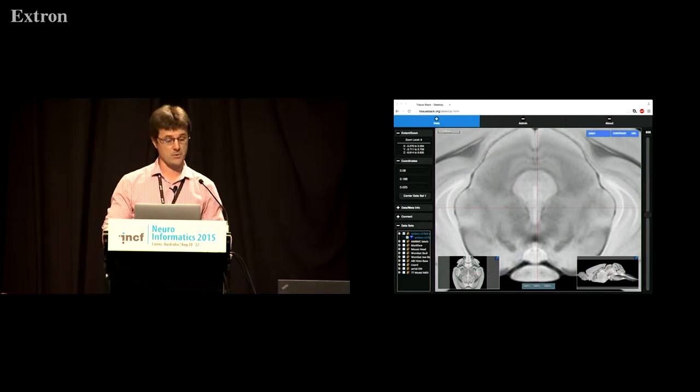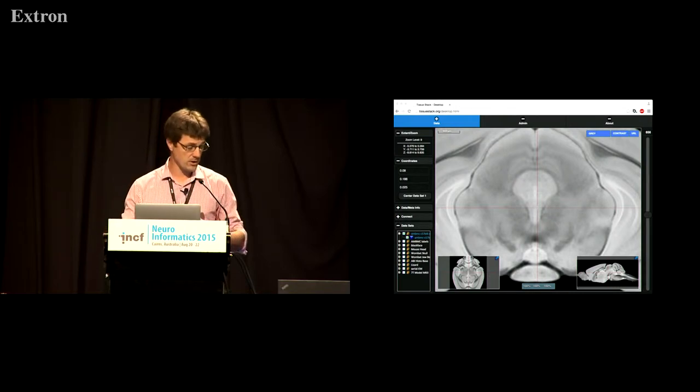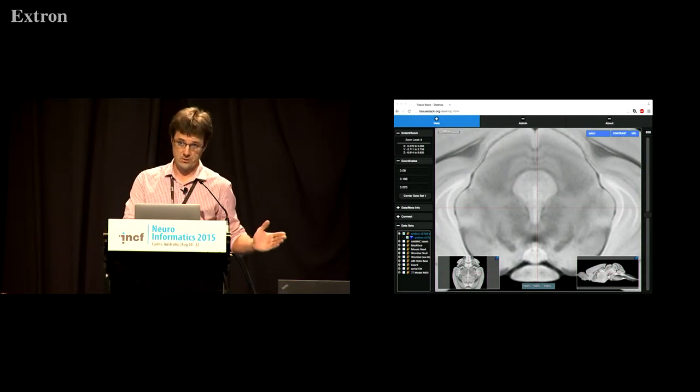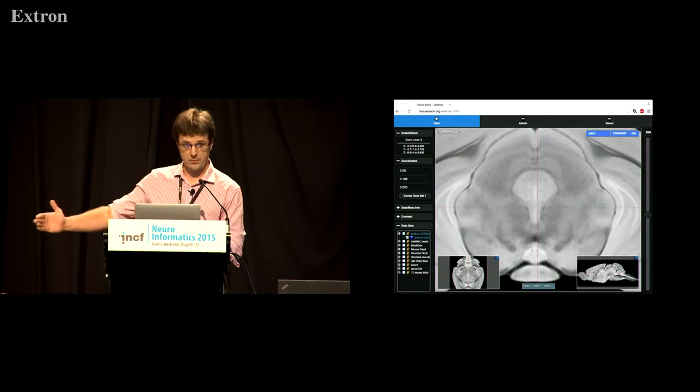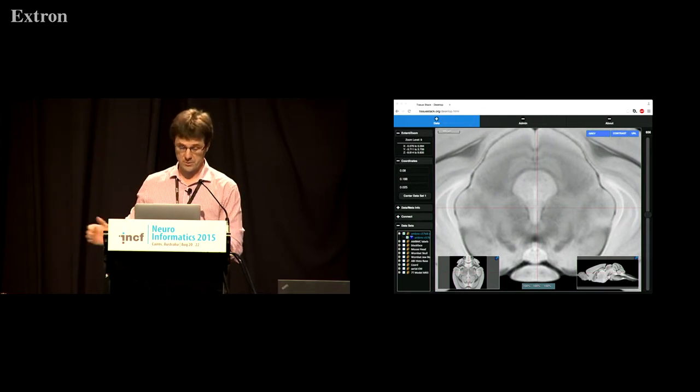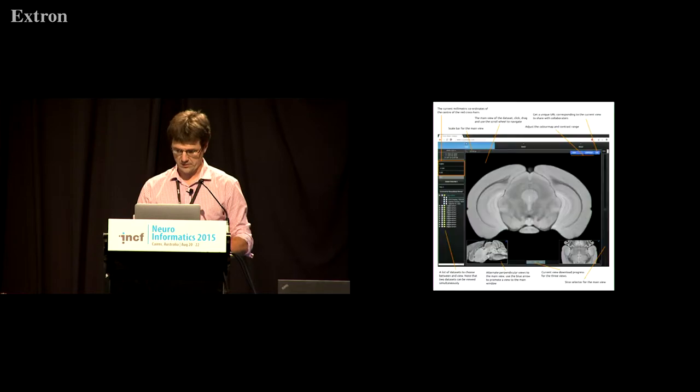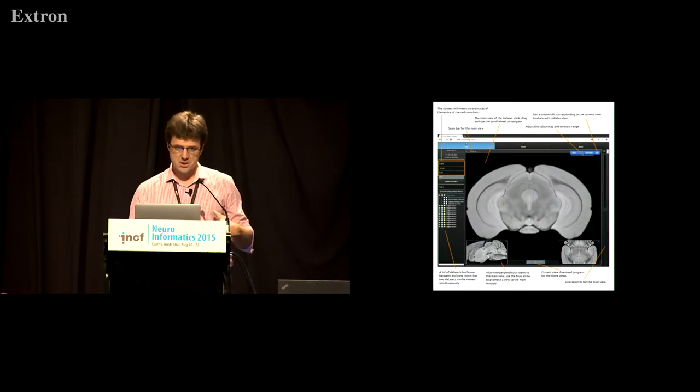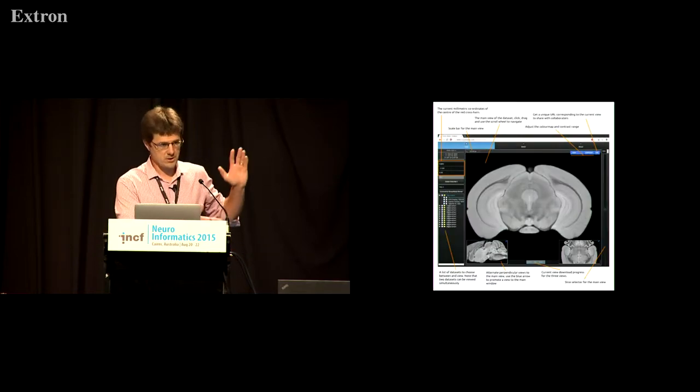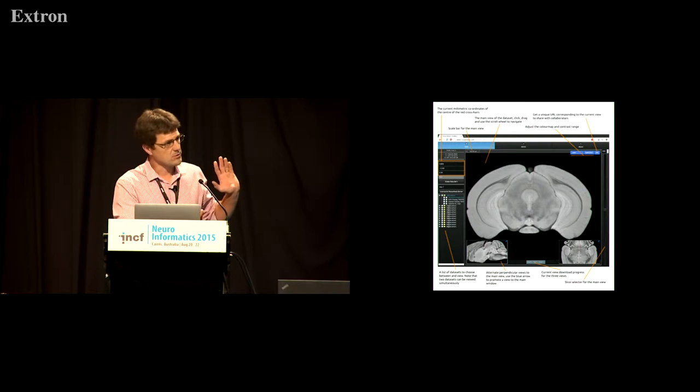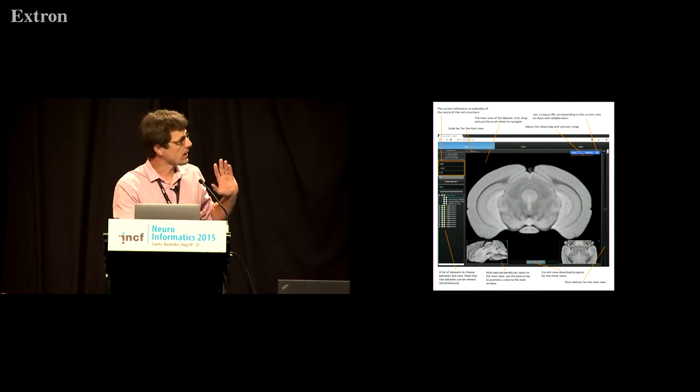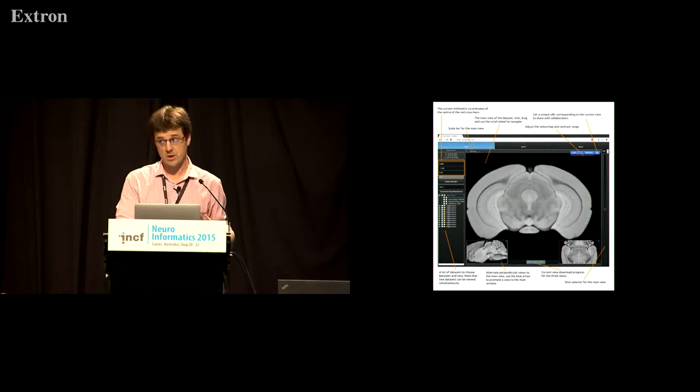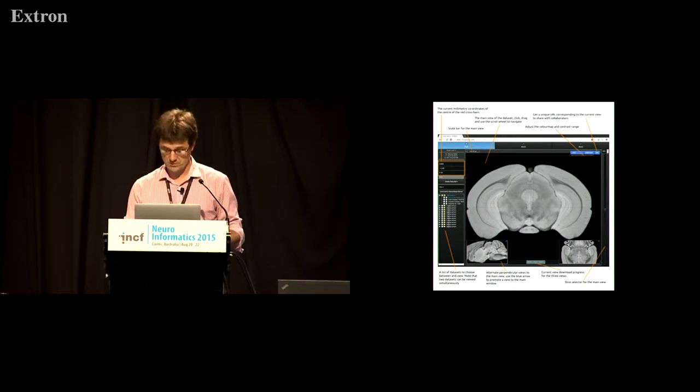This is the question we asked ourselves about five years ago now. So we set about to develop a system to do this. And this is what we came up with. So this talk from now on has nothing to do about neuroscience, sorry, and all to do about informatics and nerdliness. This is a screenshot from the manual. There's various user interface elements, and I'll just go through now in the next couple of minutes, some of the things which I find interesting and useful for our neuroscience users.